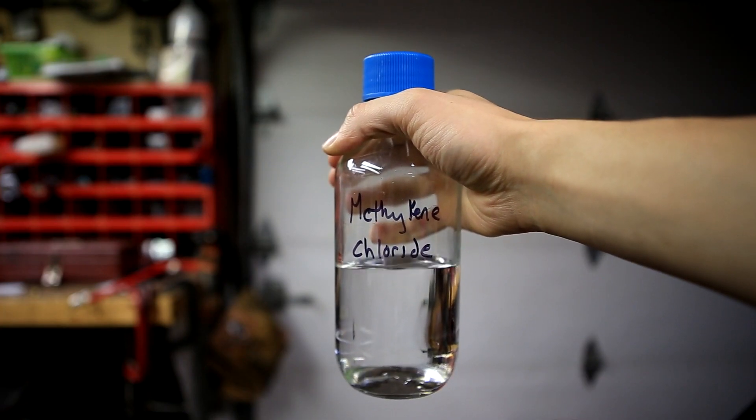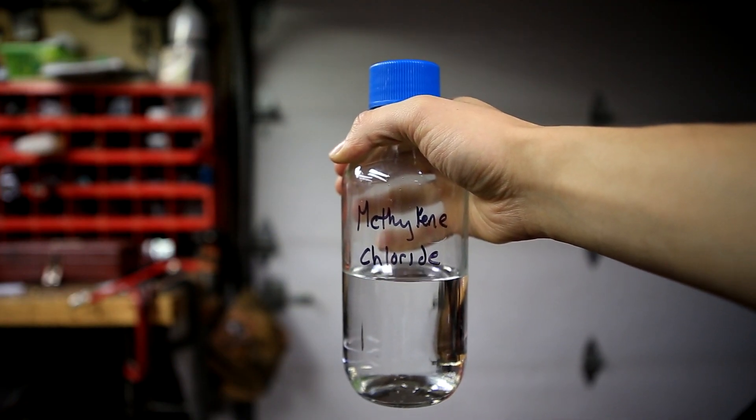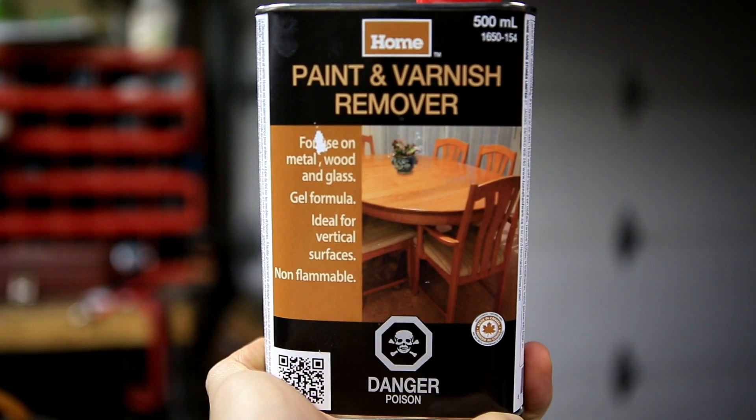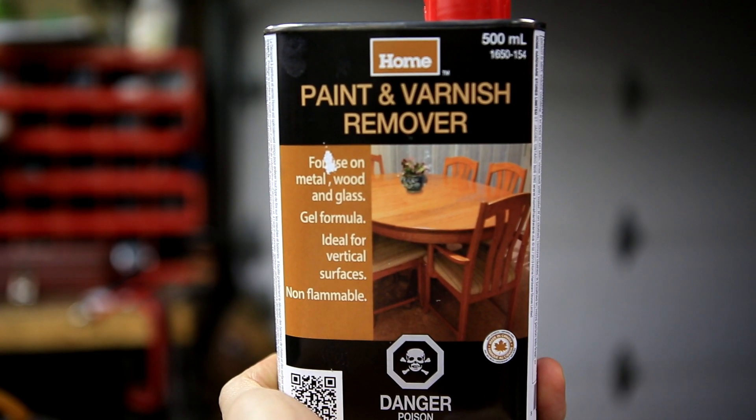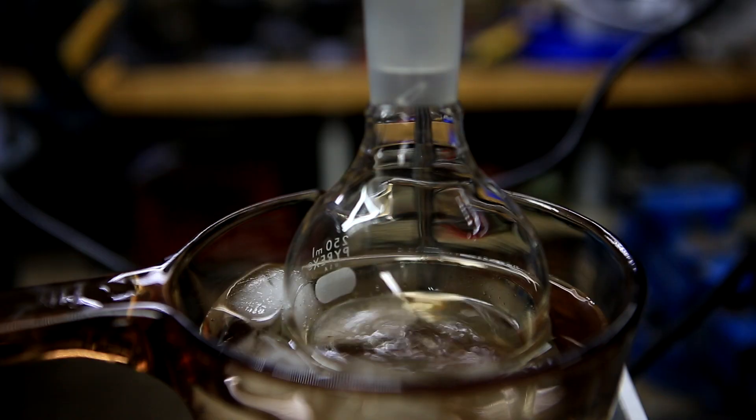Methylene chloride, or dichloromethane or DCM, is a very useful organic solvent. It is not commonly available for purchase, but it can be easily separated from paint stripper. In a future video, I will use this methylene chloride to separate caffeine from tea.